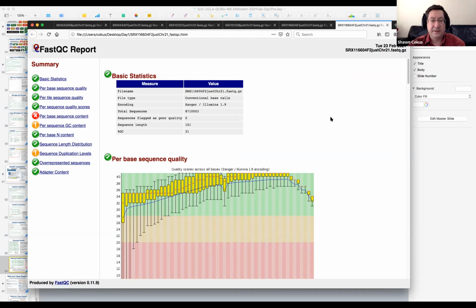So let's start looking at these. I don't think the order matters too much. So these ones I've chosen, they're a little older runs, and bisulfite's always been hard on the machines, as I said. So you see some more interesting stuff in these, more bad stuff than you might see if you've done these reports before for like RNA-seq and so on. And we're going to make some decisions based on what we see in these reports. Now, not everything FastQC does is particularly relevant, and not all of these red X's. That's actually totally expected because we know the base composition is screwy in bisulfite libraries.